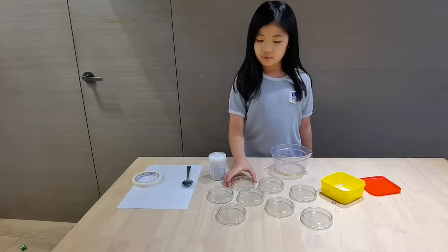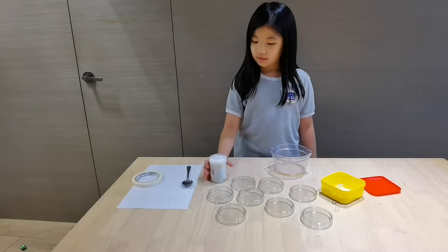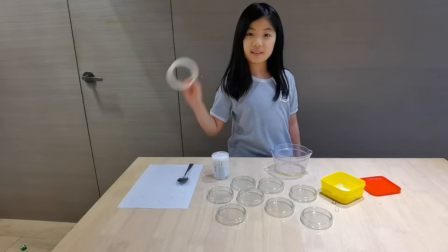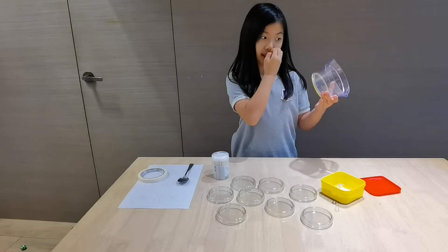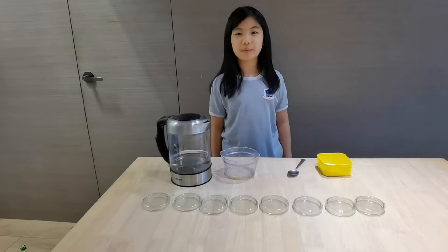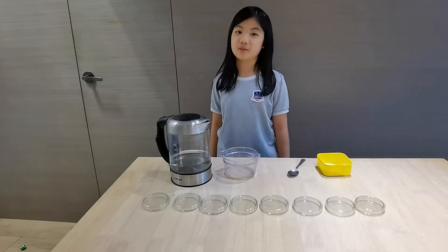So we will need petri dishes, cotton buds, a spoon, masking tape, measuring container, and some agar powder. First we will make some agar jelly into the petri dish.